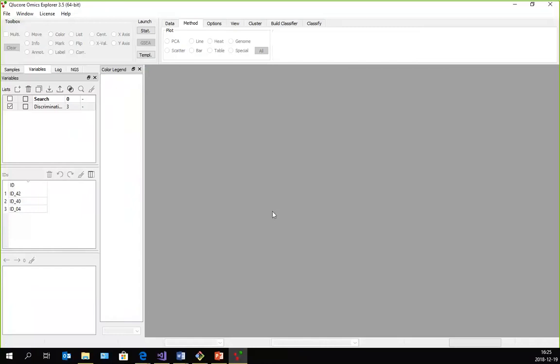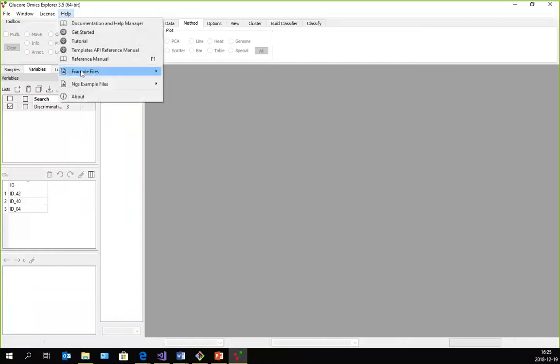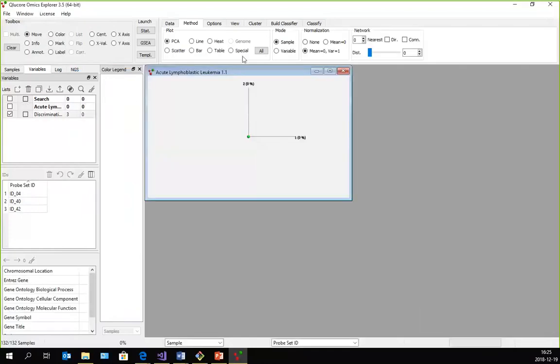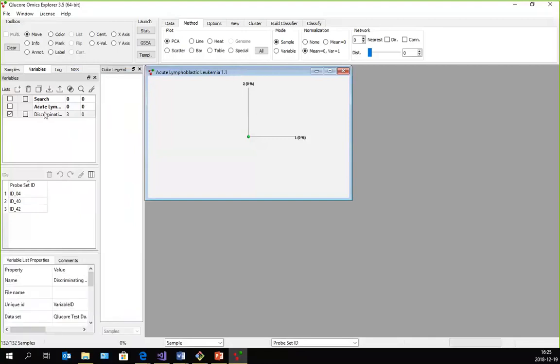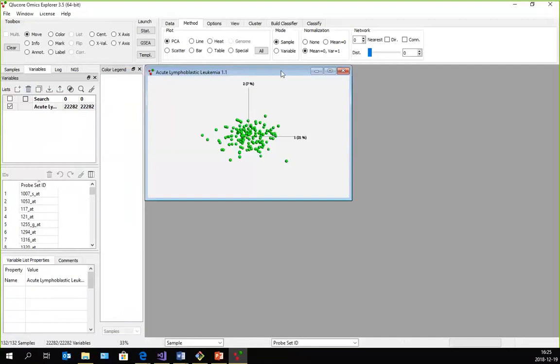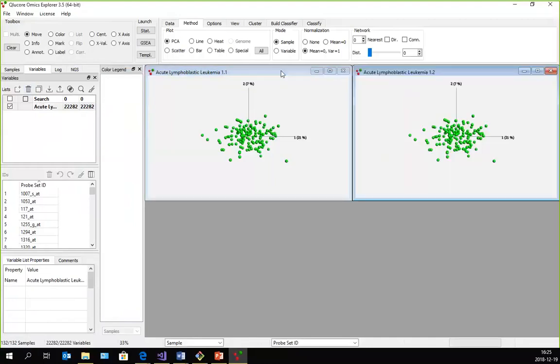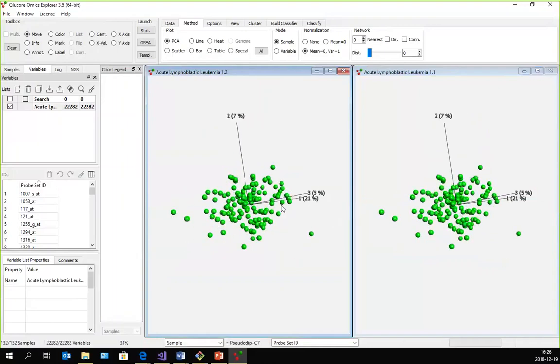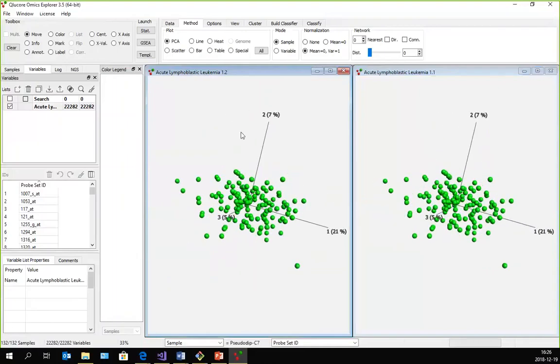I'll show a few other things here as well. I'm going to show the scree and the talus plots. And let's remove this variable list, which is not needed anymore. There we go. So if I bring up this data set, these are two synchronized plots now.